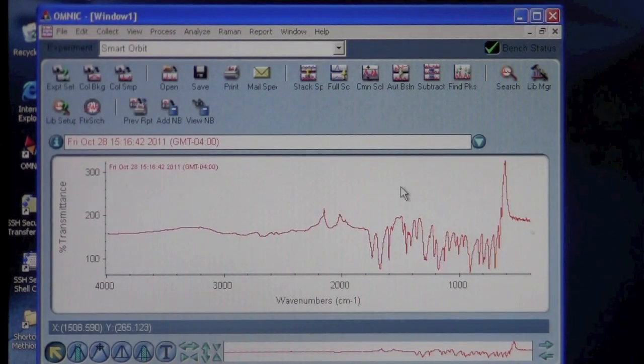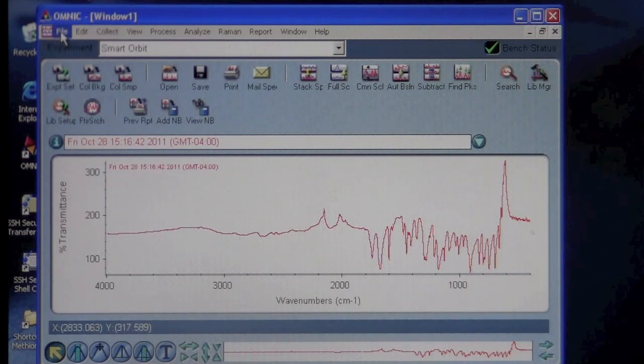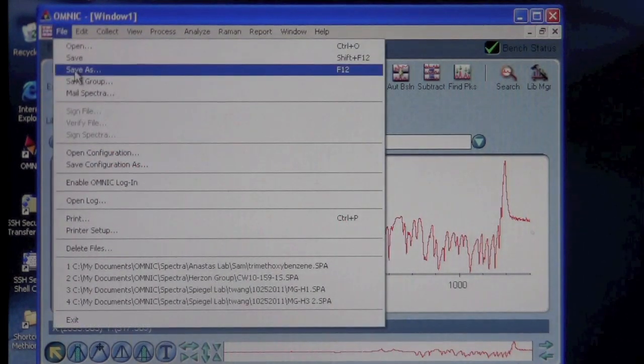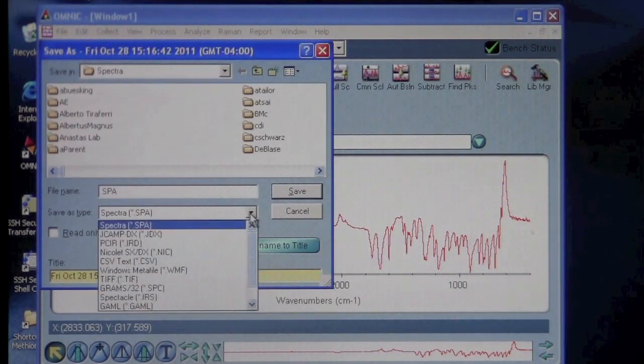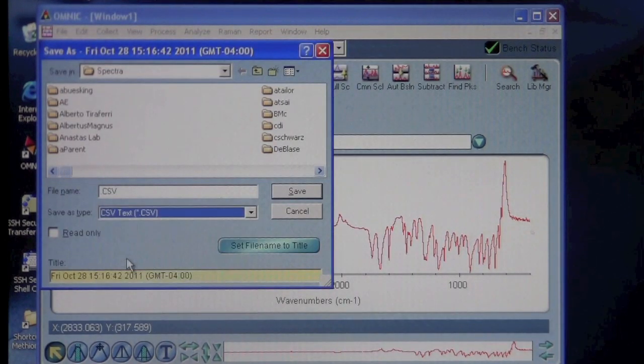Now typically we can process the data offline. Generally, what you want to do is go to File, Save As, and then you can use the file type CSV text and export it to a CSV text file, which you can then process with any data graphing program.